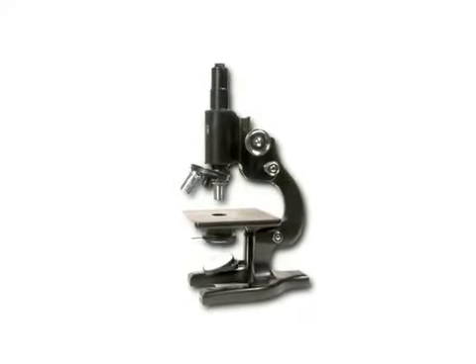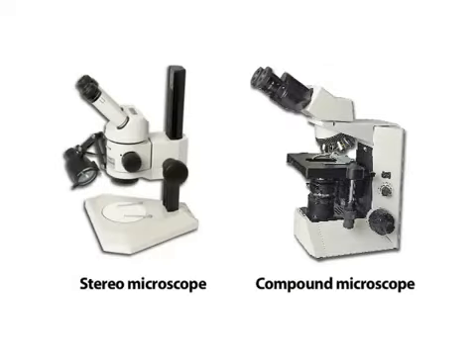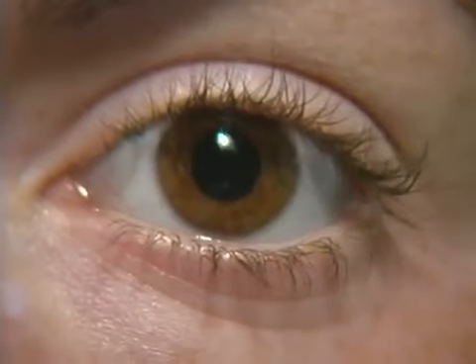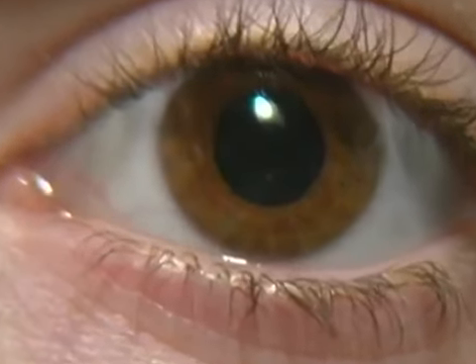Microscopes are basic tools of biology and other areas of science. This video introduces you to two types of optical microscopes that use light to help you see structures that are too small for the human eye. The history of microscopes dates back a long time.